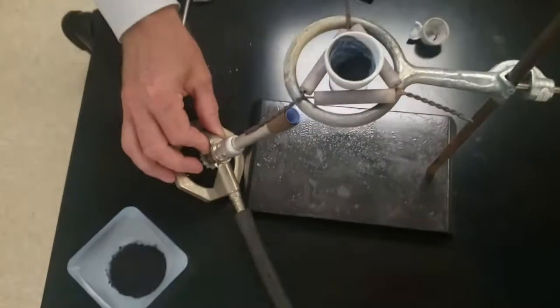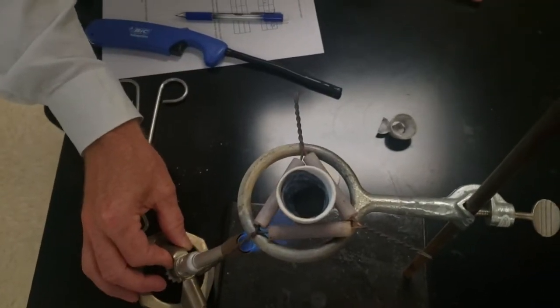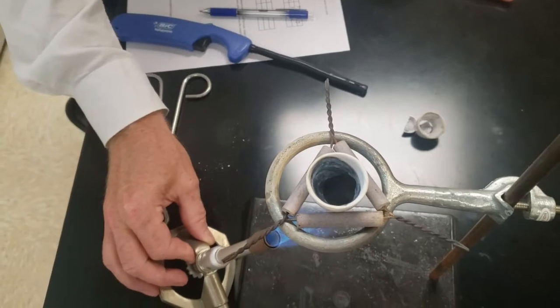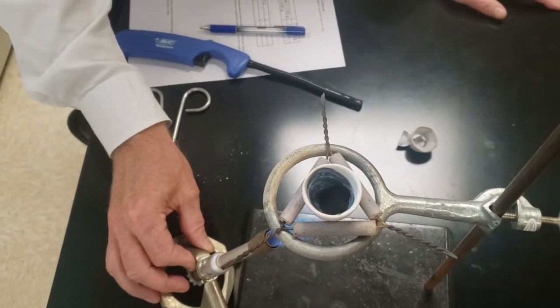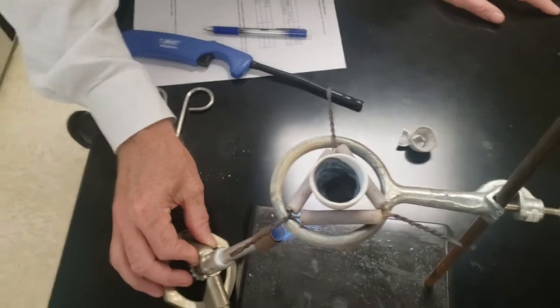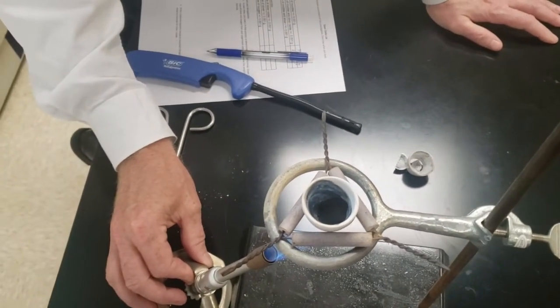But again, first rule of the lab: no freaking out. So as we heat this slowly, don't forget that heat goes up. You have a column of heat going straight up.